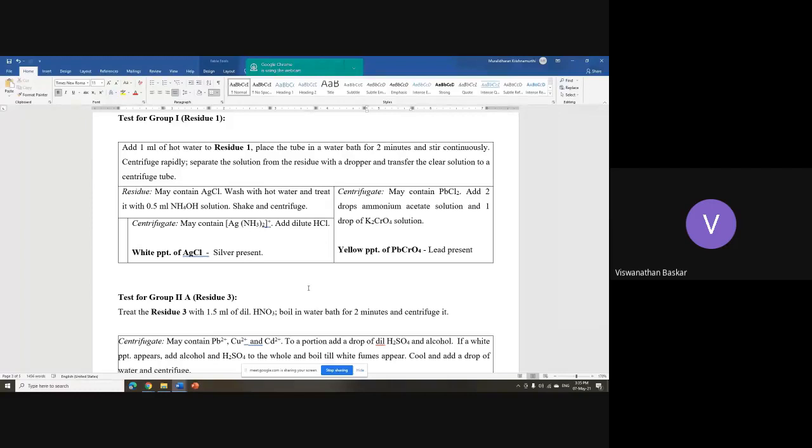Okay, so don't confuse this and that. Like here, after you find out, how can you go back there and add lead? Because you don't know first what that is. Separate the test. The test given for anions, you just try to follow whatever is said there based on its solubility, either the sodium carbonate based solution or the simple solution. And this one separately. Do not link both the compounds.